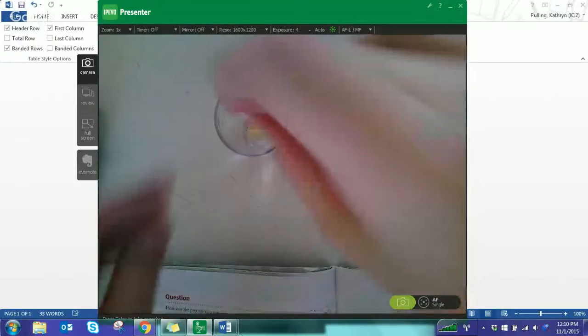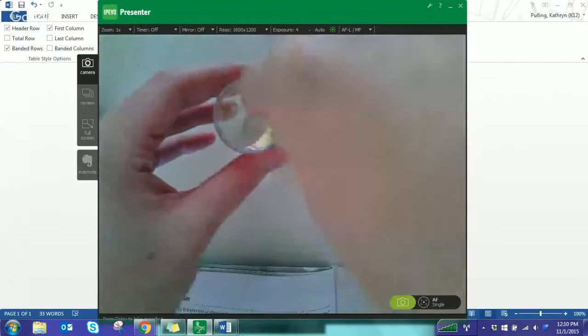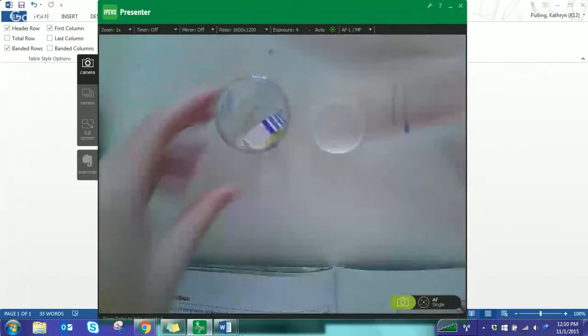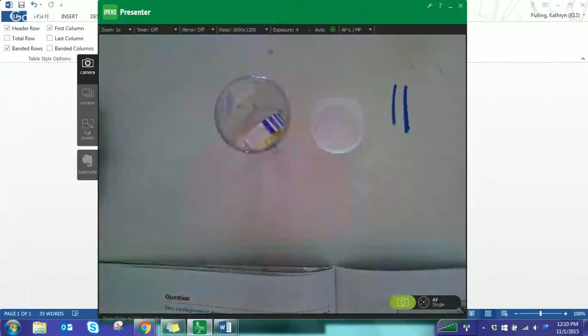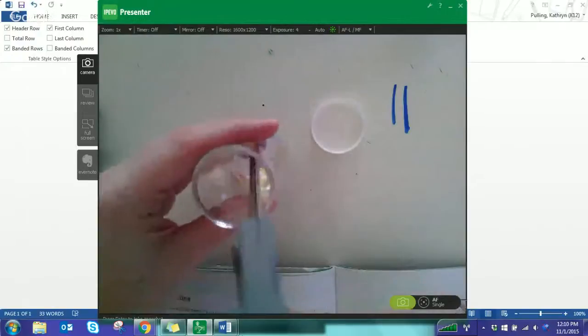But we're going to make sure that the whole thing gets submerged. So I'm going to bend this a little bit and throw it in here. Make sure all the colors get changed. Let's see. I lost my piece in there. pH of 8.3. Not an awfully high pH. You probably do want to rinse your hands after this if you have to get in there like I am. Let's see if I can use these scissors to pull it out.